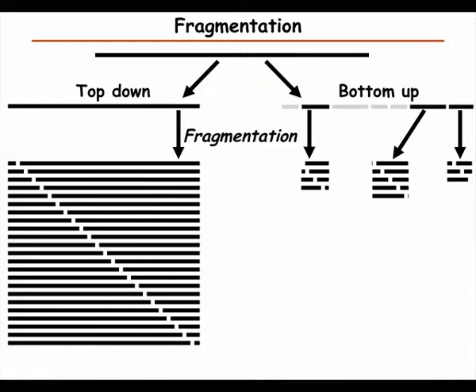The other difference is that in bottom-up, of course, we have the small peptides that we fragment. In top-down, we have to fragment the whole protein, which is usually done with collision-induced dissociation. We're more successful with small peptides, but when we go to larger proteins, people usually use electron capture dissociation or electron transfer dissociation. That works better in this case.